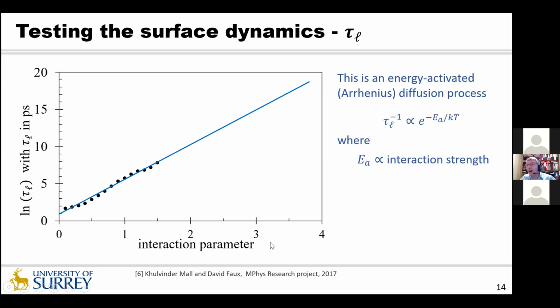This is a multiplier of the water-water interaction, if you like. So the 1 here means that the solid-water interaction is identical to that of the water-water interaction. Here's the MD data. We can only go so far.